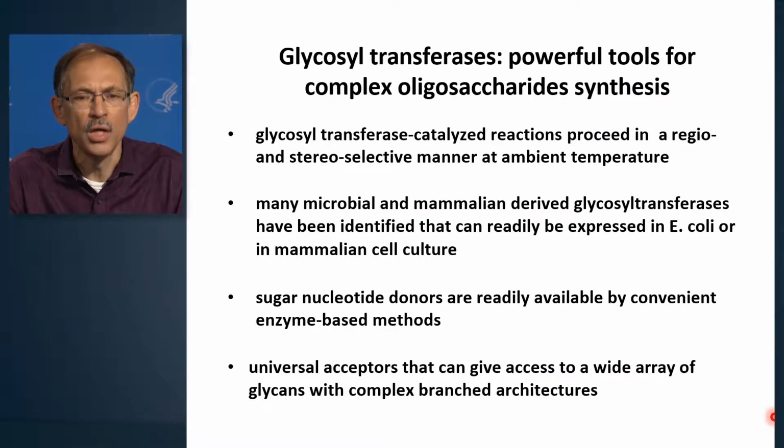The paradigm in automation is a solid support to which a growing acceptor is attached. And purification is easily accomplished by filtration and washing. However, we discovered that this approach does not work for enzyme-mediated synthesis.